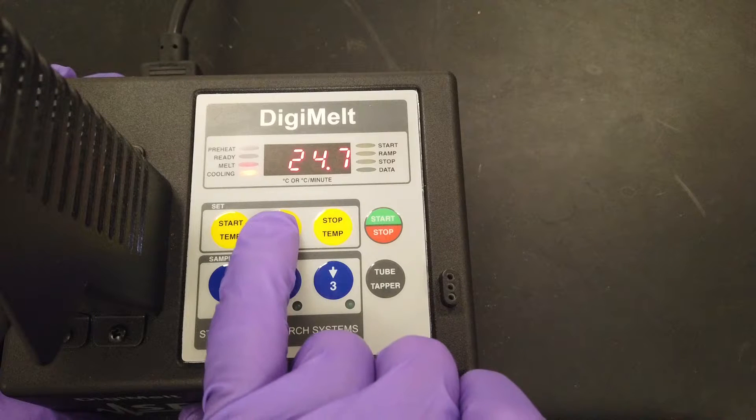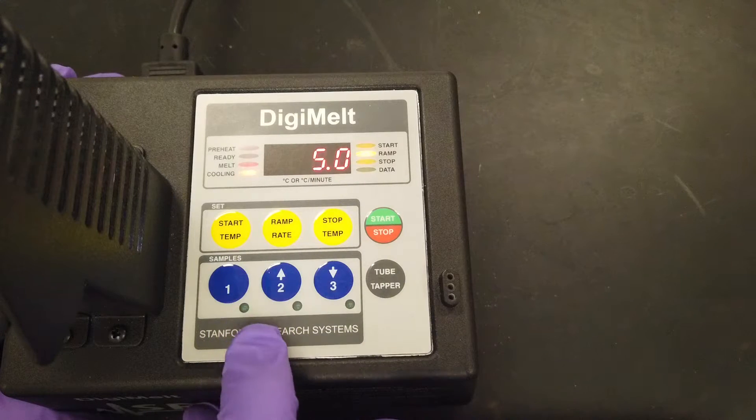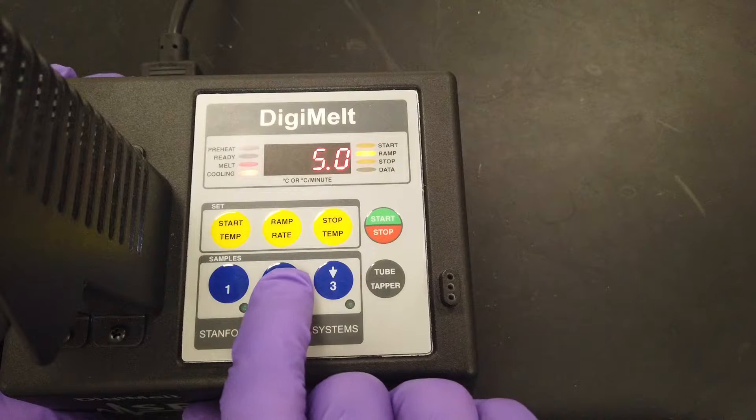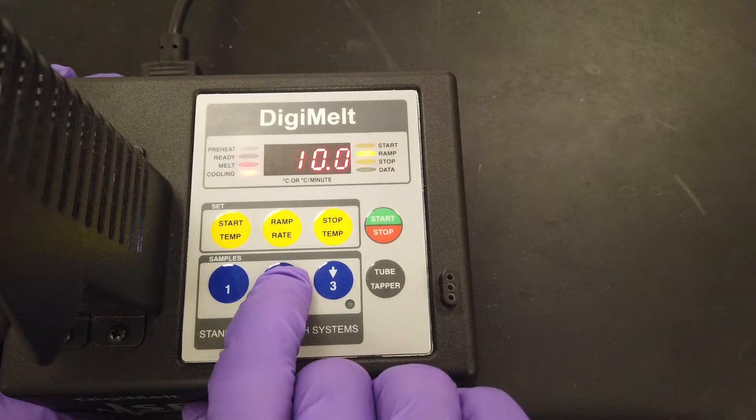Next, press the ramp rate button. Again, press the up or down arrow to select the ramp rate. Typically the slower the ramp rate, the more accurate your measurement. Press the start stop button to confirm.